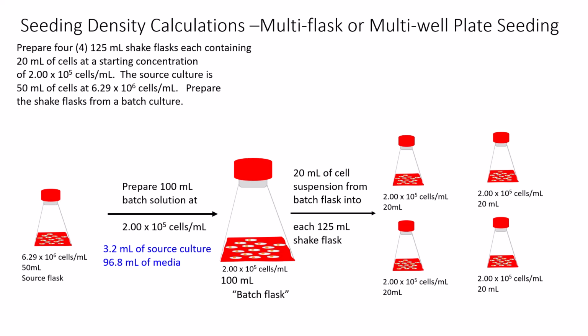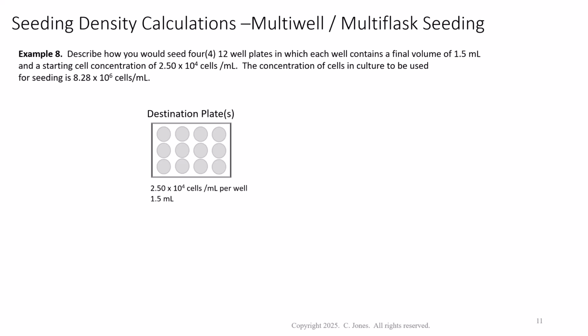All right, now the important thing here is that when you're doing these multiple kinds of passages, right, from the same flask, you need to make sure that you're constantly agitating the flask gently so you don't generate shear, but you need to constantly agitate the flask so that the cells don't settle, right? So you need to make sure that you have a uniform distribution of cells throughout the flask, side to side, top to bottom, analytically identical throughout, all right? And that means that you have to mix frequently.